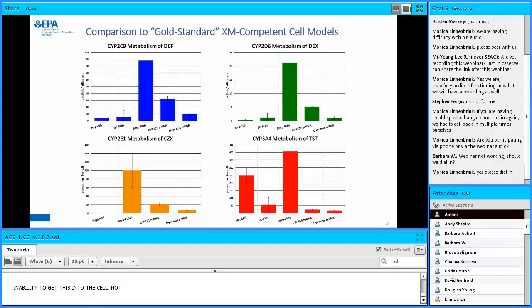A couple of things I want to point out here. One is the earliest time point that we measured was 1 hour, and the primary human hepatocyte and HepaRG data were largely 15 to 30 minutes, when metabolism is at its zenith. So our competitor cell models have essentially a built-in advantage there. The biggest built-in advantage, though, that the liver cell models have against our cell models is that none of these 4 benchmark substrates, not in any of the studies that we looked at, nor the tech sheets from the commercial sources, used DMSO as the solvent to solubilize these substrates. We use DMSO.